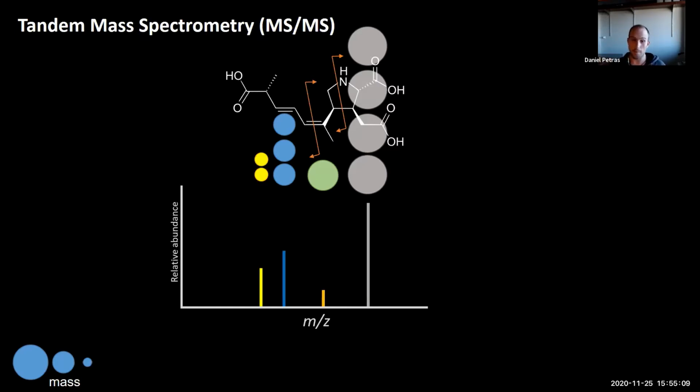And that is a big part of GNPS. The GNPS library is a user-based library where all of us can annotate our molecules and then make this knowledge available to the community. Seeing that grow over the last 5 years or so is really something amazing, because from initial annotation rates of 1%, we can now annotate 5 to 10% of the molecules we typically detect.